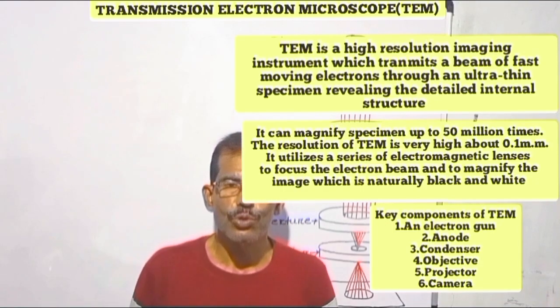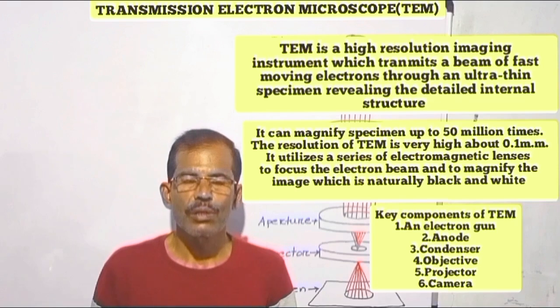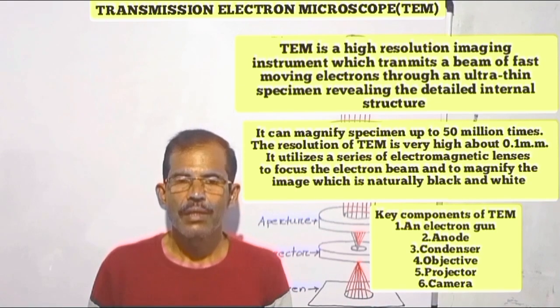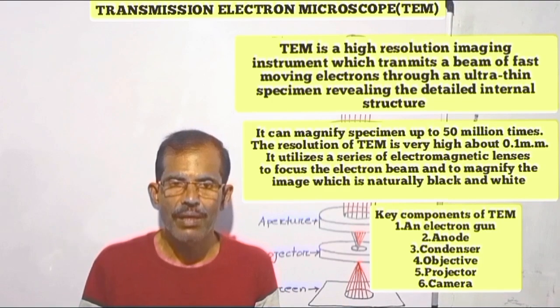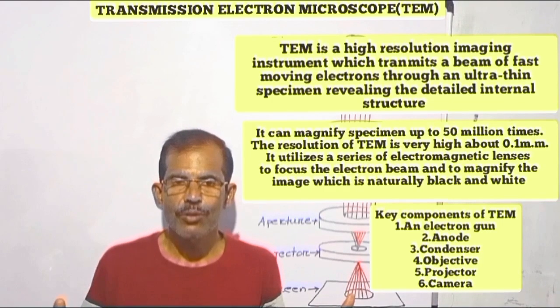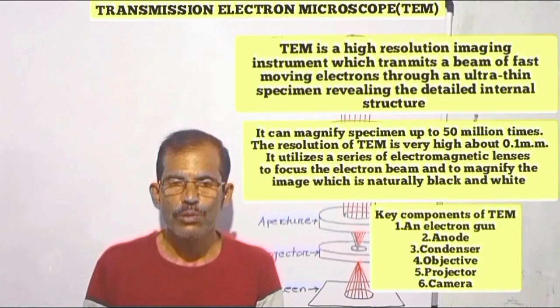Transmission electron microscopy is a high-resolution imaging technique used to study the detailed internal structure of different types of cells and intracellular organelles, to identify viruses, to study the mechanisms of various diseases at the cellular level, to characterize nanomaterials and particles, and also to examine metals, alloys, ores, and crystals to identify defects.